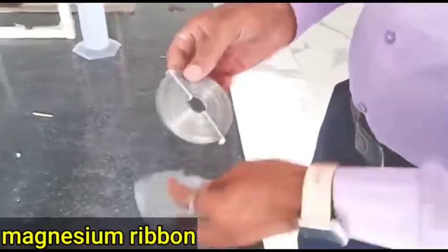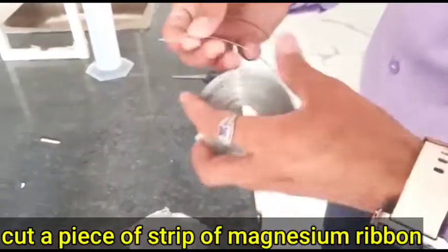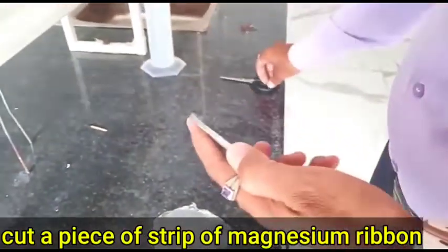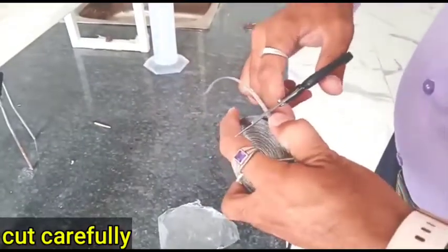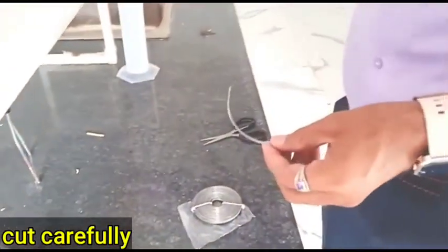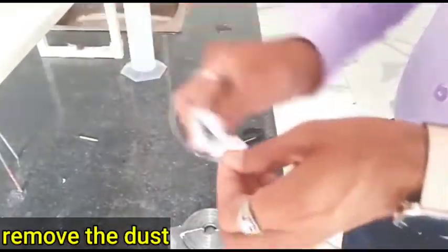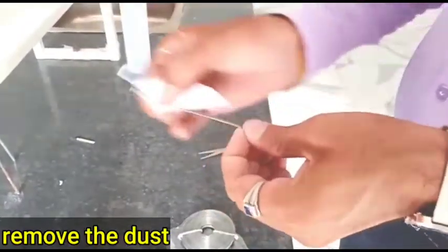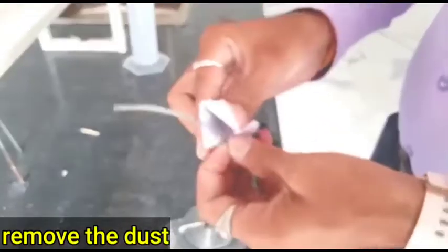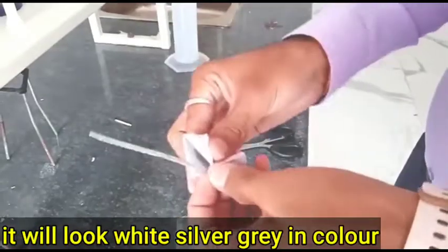This is Magnesium Ribbon. First, cut a piece of Magnesium Ribbon, then rub it carefully and strongly to remove dust on it. Now it's clear. You can see it's a silver gray color.